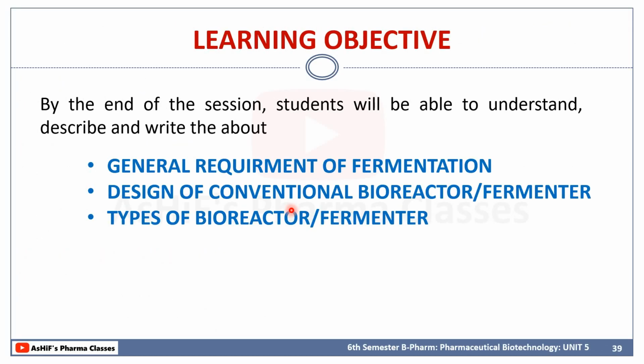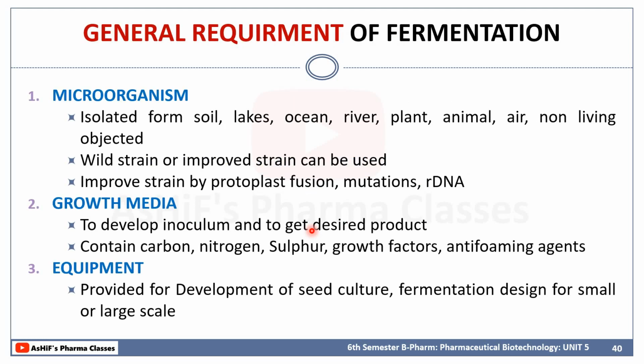Based on that, this is the learning objective of the session. By the end of the session, students will be able to understand, describe and write about general requirements for the fermentation, design of a conventional bioreactor or fermenter, and types of bioreactors as well as fermenters.